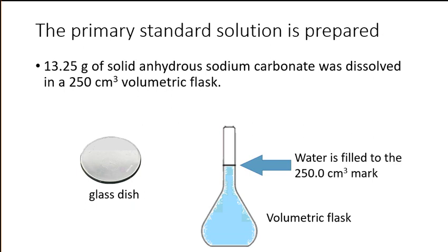And the number of significant figures is in fact 4 in such a case. So I'll consider that to be 250.0 cubic centimeters, where that last 0 is the uncertain digit.